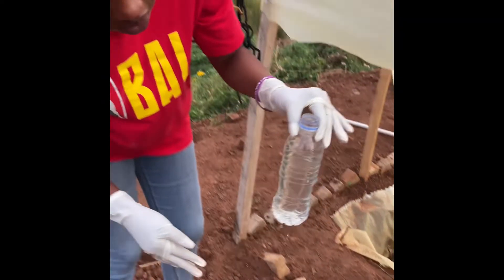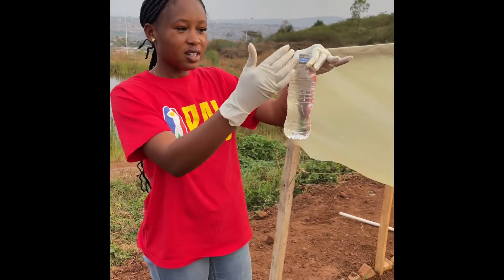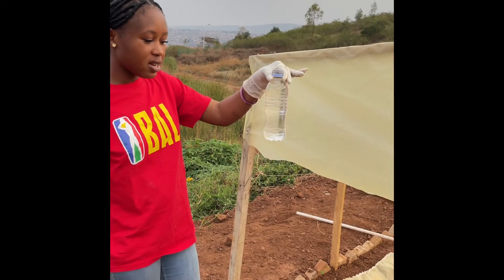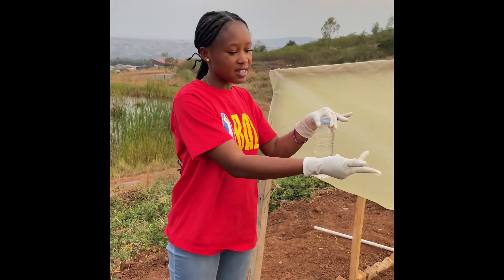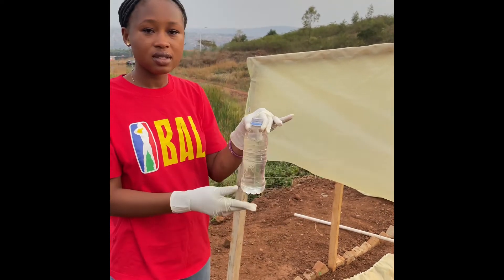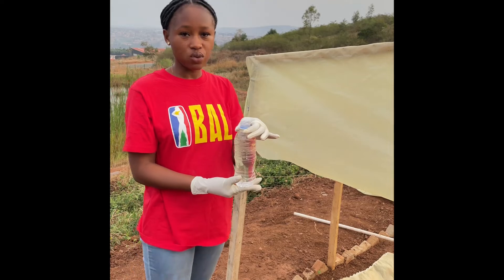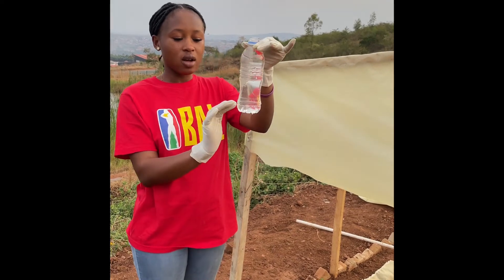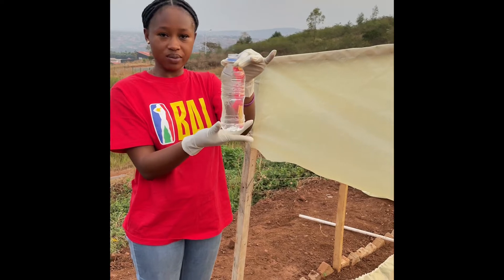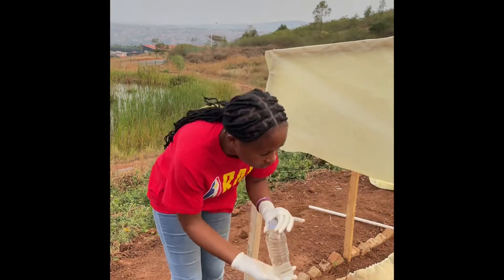I filled it to make sure that there are no bubbles in the test tube. For the next step, I'll be inverting the gas tube into the water to see how it works. When it works, the gas would come up below the bottom and we'll see the level of the gas.